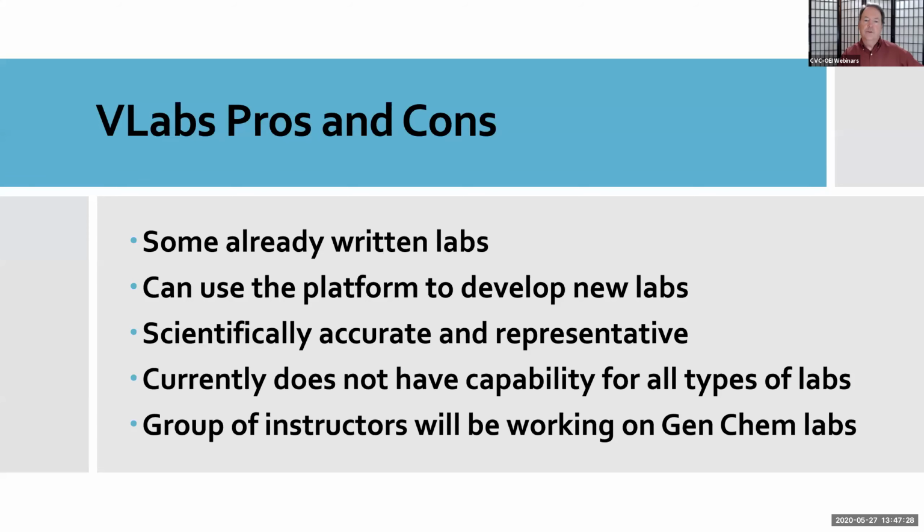Mark, question: do ChemLabs and VLabs experiments come with a module with pre-lab procedure, post-lab discussion questions? The ChemLabs, the way they're set up, they have an introduction and then a procedure and then an analysis section. And that's sort of the instructions on the right side with the lab, the lab tabletop, virtual lab on the left side.